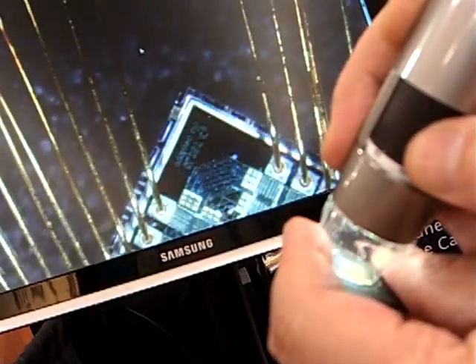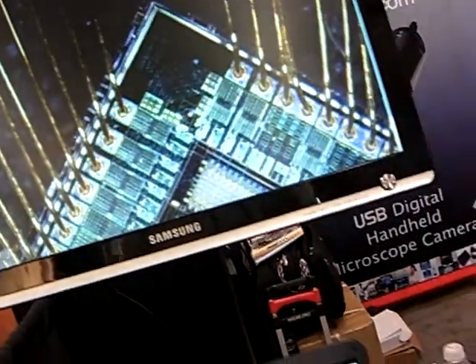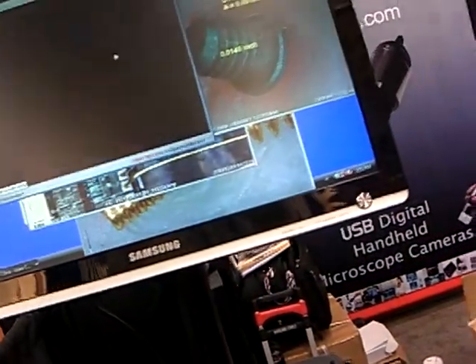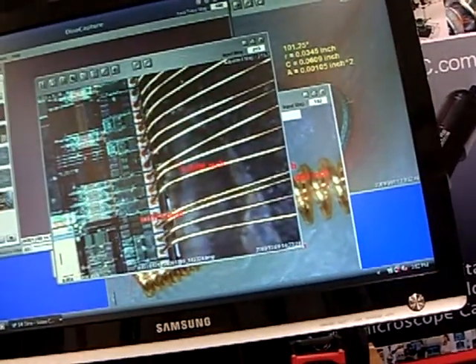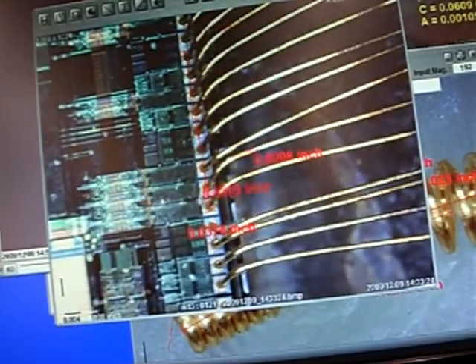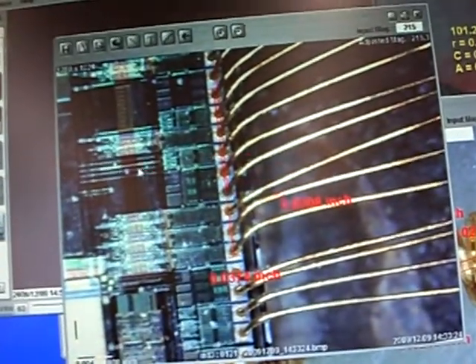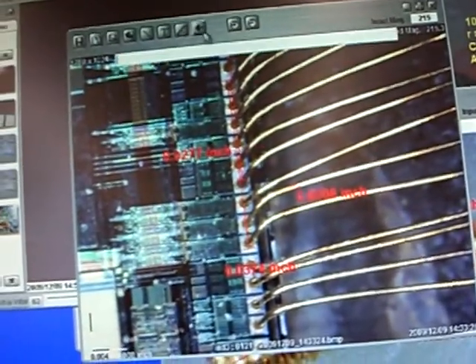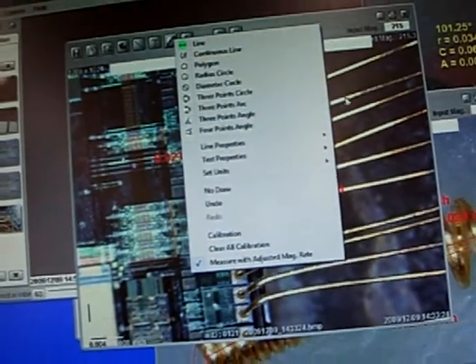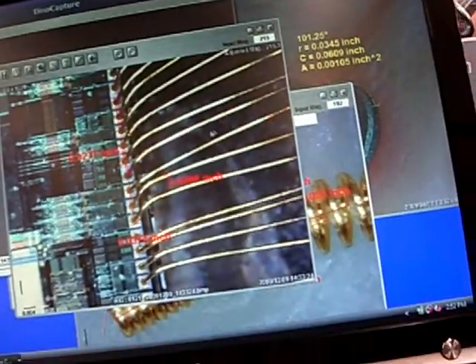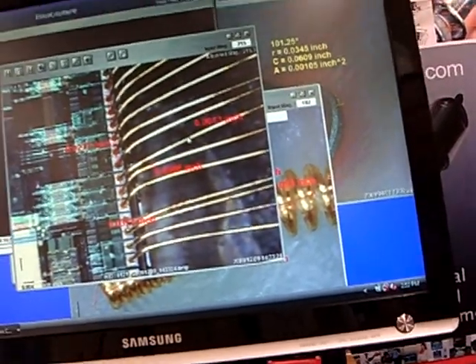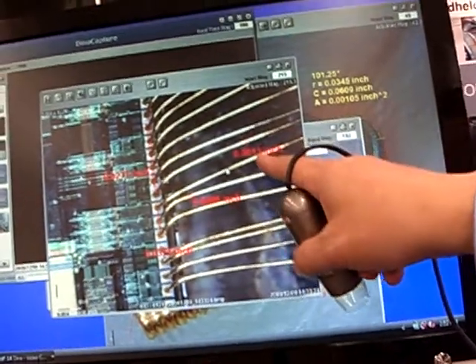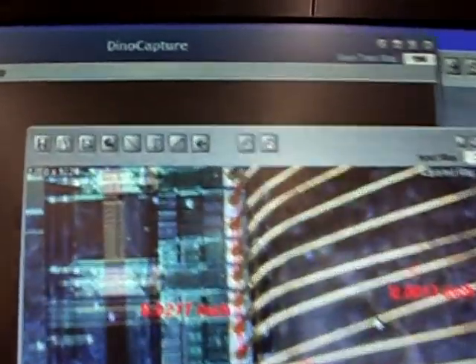This can do measurements. We have a couple of measurements here. I'll show you how it works. You just point from A to B and measure. Or you can go to a small area, like this A to B. You can see it's about 1.003 inches.